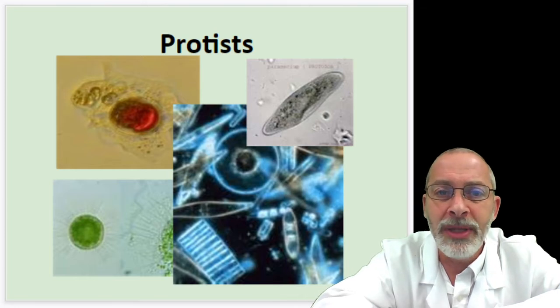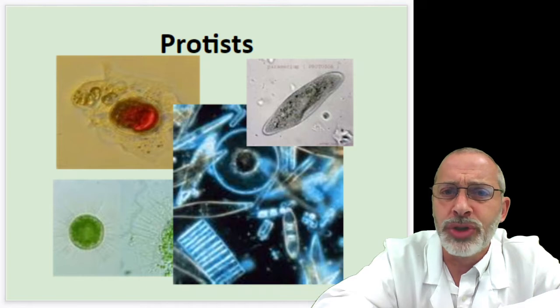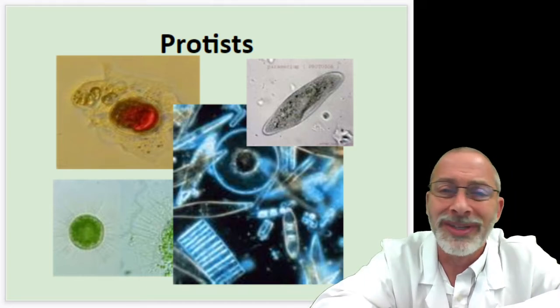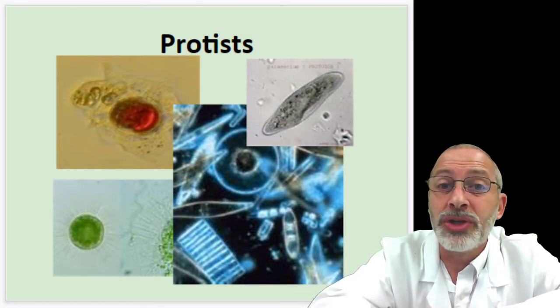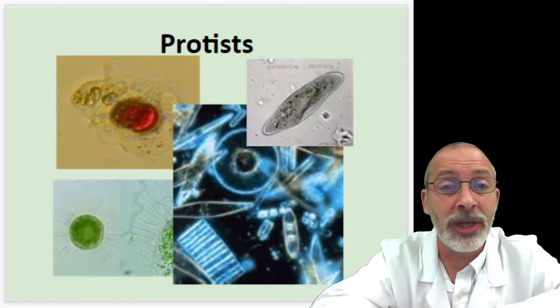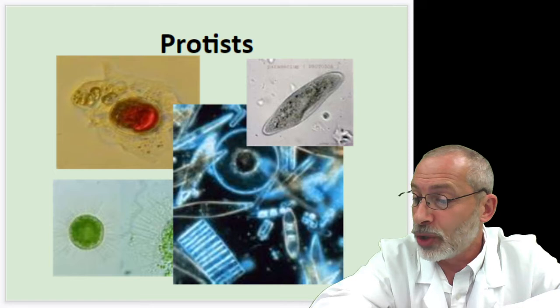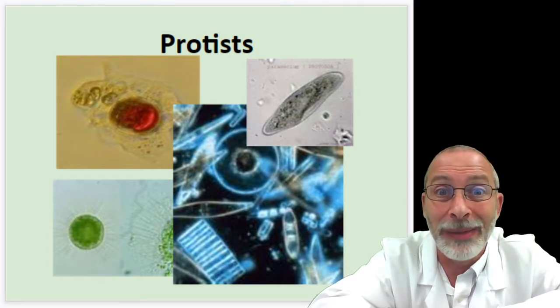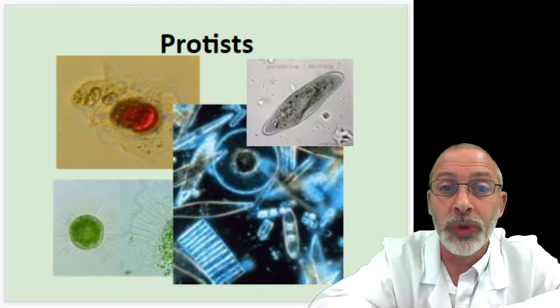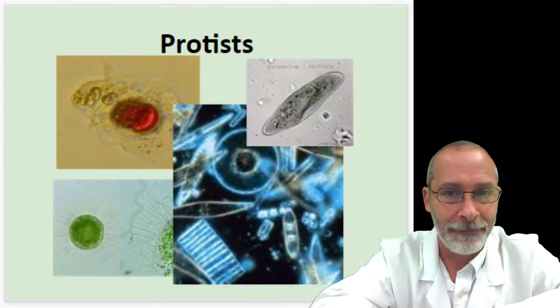As we examine these 4 specimens, how do you think we're going to be able to distinguish or tell the difference between one species and another? What are some of the characteristics that we should be looking for? I'm going to give you a big hint here. If you look at your procedures, step 4 gives you a big hint if you're looking at bold and italicized words. So be sure to review that. Hint, hint.